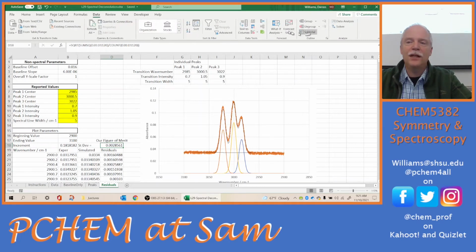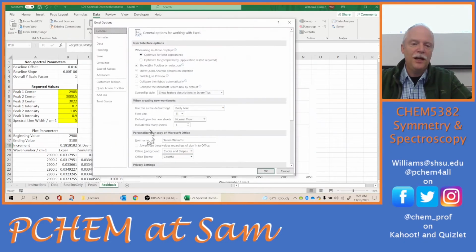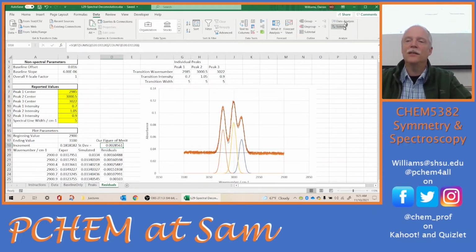A few weeks ago, I said if you don't have a data analysis, then you go through a file. Since we're in a new video, I'm going to go ahead and do that. Options here. You come down to the add-ins. And down at the bottom, you have Excel add-ins. You hit go. And there's a couple of options here. Analysis ToolPak, which allows you to do linear regressions.